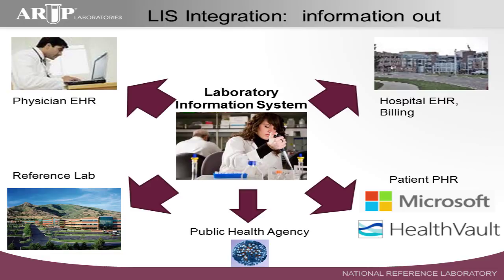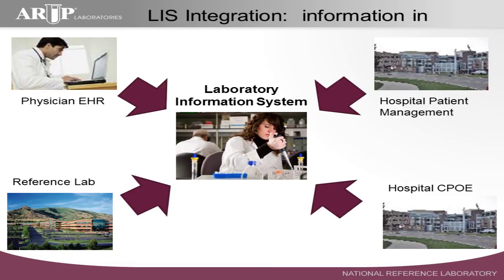And typically, from an IT perspective, when you're looking at exchanging information in a laboratory environment, the data they want first, if they do have to prioritize it, are the results. So you'll do this first. You usually push data out of the lab system before you ever pull it in from a different system. But you do need data into a lab system if you want to integrate it well in the healthcare arena.